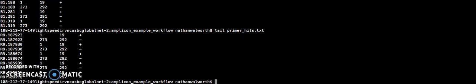But for a little explanation, quality filtering, again, is critical in reducing the abundance and impact of spurious sequences. There's an intrinsic error rate to all sequencing technologies and DNA polymerases that will consistently be generating some portion of sequences that vary from their true biological origin. And this can substantially inflate metrics such as richness and diversity. So quality filtering is one of the steps in place to minimize that problem.